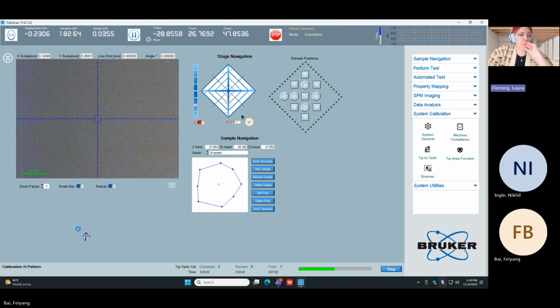And I think there's a dynamic thing, I forgot the whole name of it, that you said we don't have some of the hardware for. Maybe we're not eligible to get that data. So I guess my question is, what's the full capacity of it? What do we need to add extra to get that information if we want?